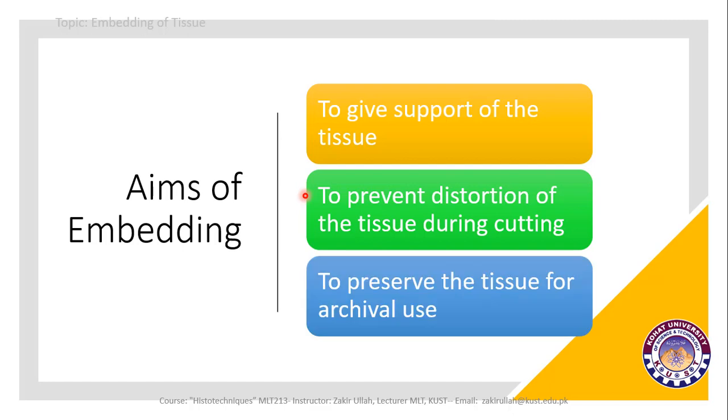The third aim of embedding is to preserve the tissue for archival use.